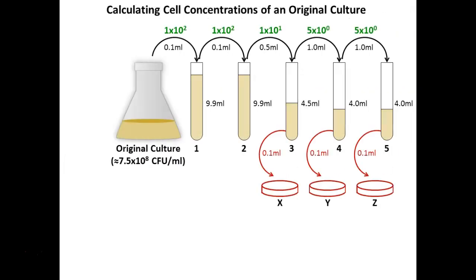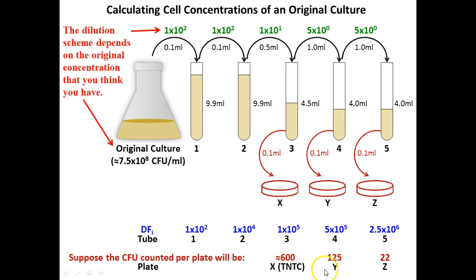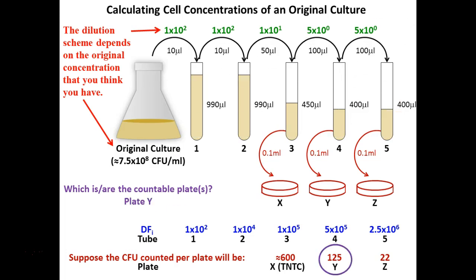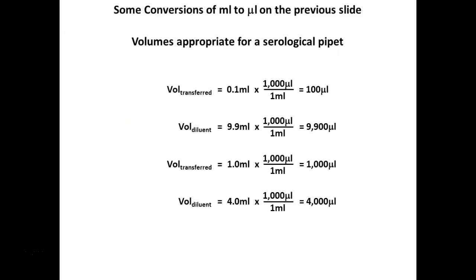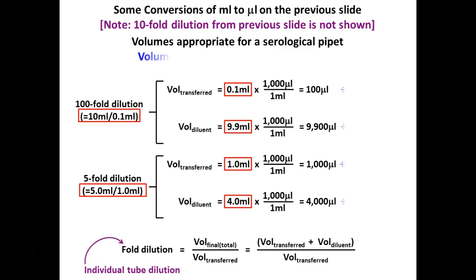Oh, here's my setup from today. So this is what I actually did today. This is some guesstimates, right, of what we may get. So we'll find out next week what we actually got. So notice I did it in milliliters. So again, you can go between milliliters and microliters. I did it in microliters. I can't get the two straight today. So this is just showing you our conversions and how it's the same. And then just another calculation.